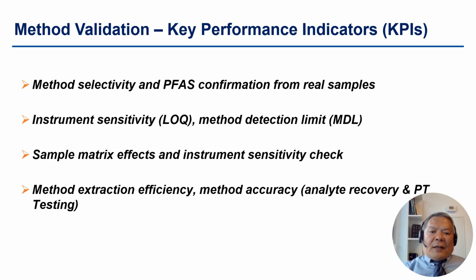In the following slides I will discuss the validation criteria, such as method selectivity, analyte confirmation from real samples, instrument sensitivity, method detection limit, sample matrix effect, extraction efficiency and method accuracy.